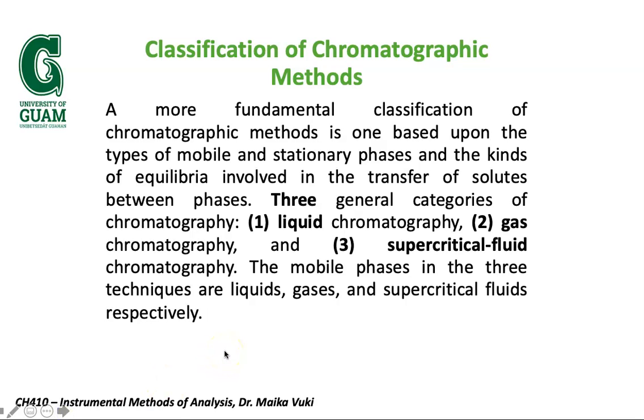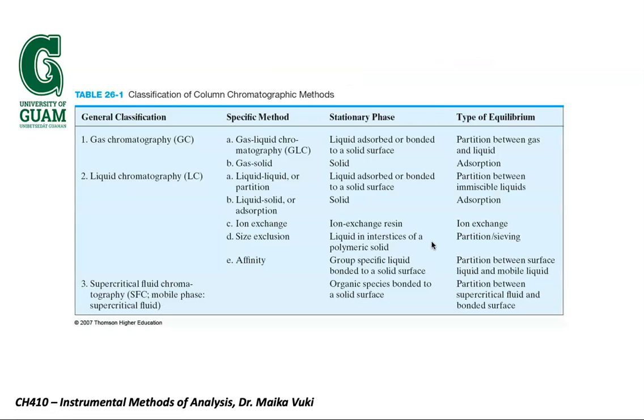However, the more fundamental classification of chromatographic methods is based upon the types of mobile and stationary phases used. There are three categories here: liquid chromatography, where the separation is based on liquid-liquid partitioning; gas chromatography, in the gas phase; and the third one is supercritical fluid chromatography.